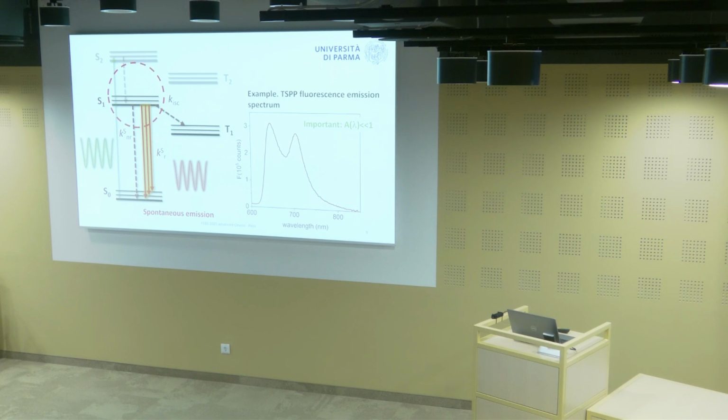I like to bring toys with me, so I'll show you one. This is one of the slides people use to align microscopes. That's fluorescence emission. If I shine CW light, you still see the fluorescence emission. But when I shine the light off, fluorescence is gone. It's an event which takes very little time. If you remove the perturbation, the event is gone very quickly.